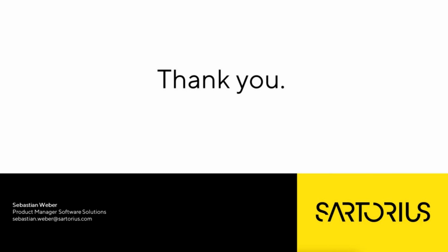Great. All right, this next question has a few parts to it. It starts out, what is the current expected durability of the touchscreen panel, especially if multiple samples are weighed or screen touch activity? Chances of decrease in sensitivity or ghost touches are common in touchscreen?